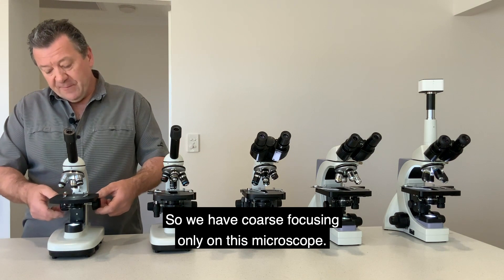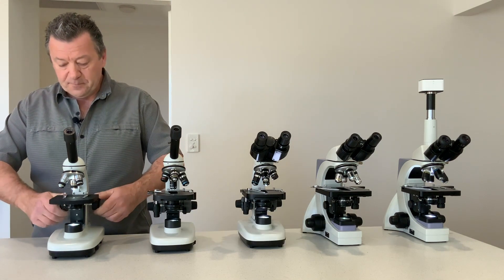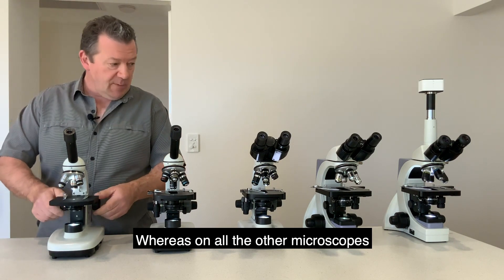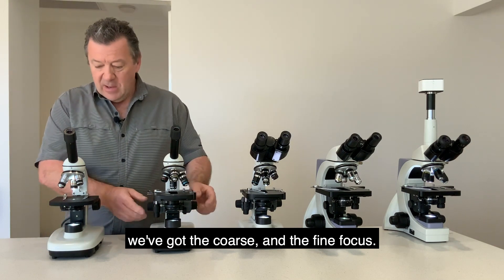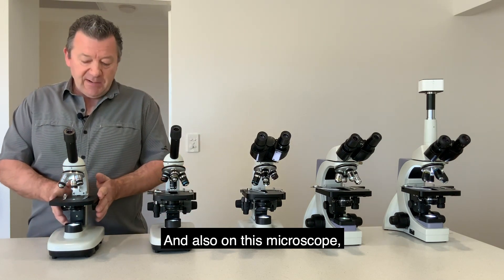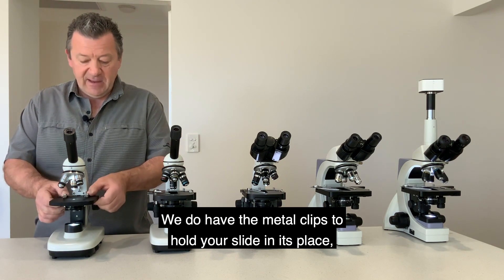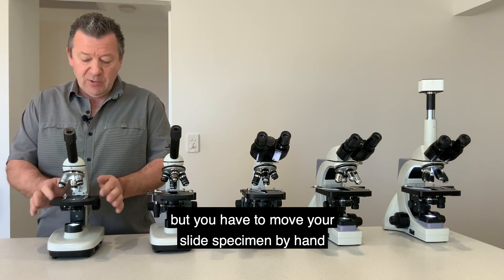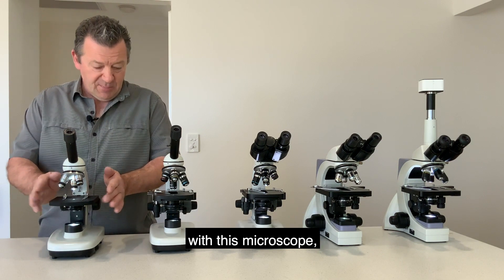On this microscope we have coarse focusing only, which moves the stage up and down, whereas on all the other microscopes we have coarse and fine focus. Also on this microscope it's a fixed stage — we have metal clips to hold your slide in place but you have to move the slide specimen by hand.